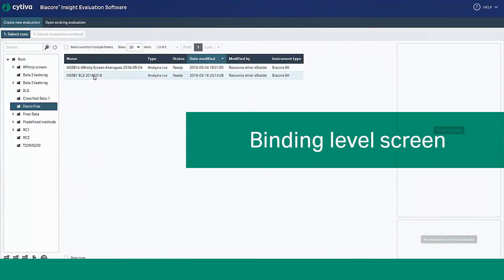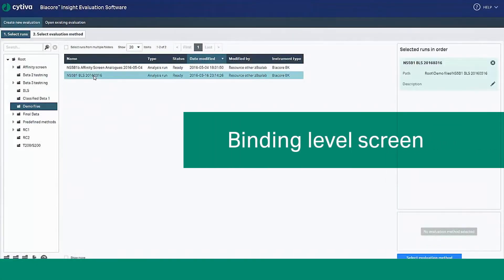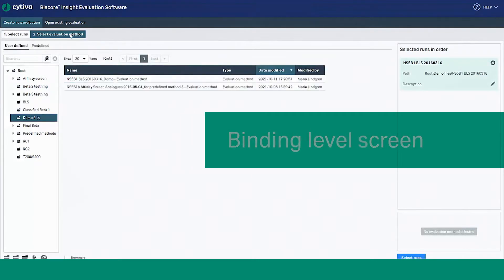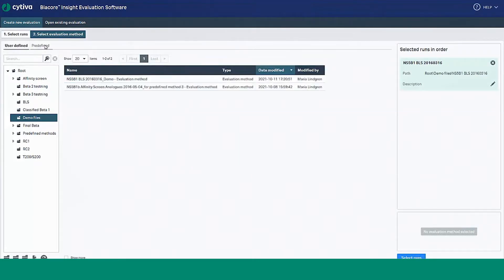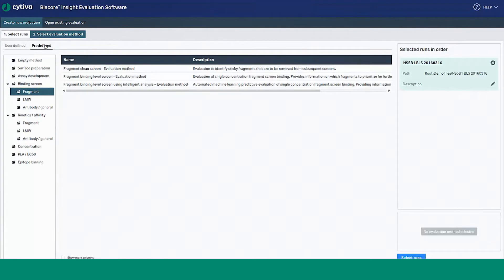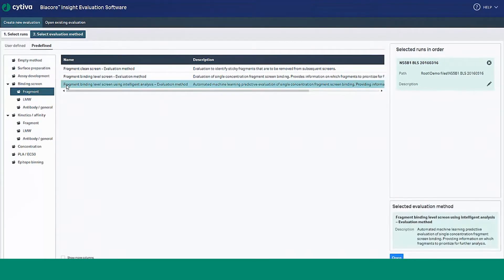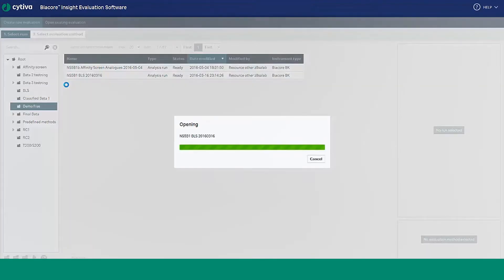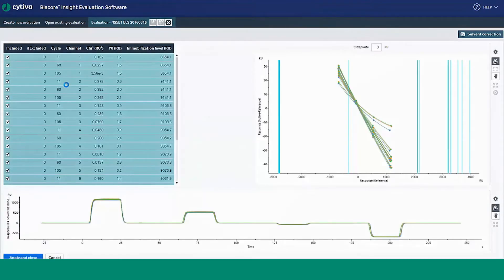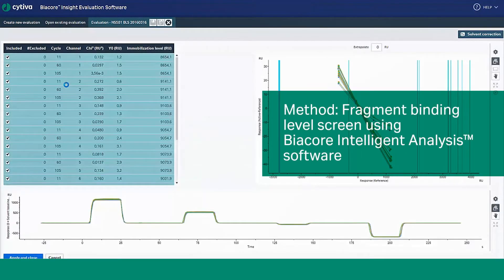Let's start by looking at the Binding Level Screen functionality, which automatically analyzes and classifies your binding level data using a series of feature sets. In this example, we have opened a Binding Level Screen data file and applied the evaluation method Fragment Binding Level Screen using Biocore Intelligent Analysis.